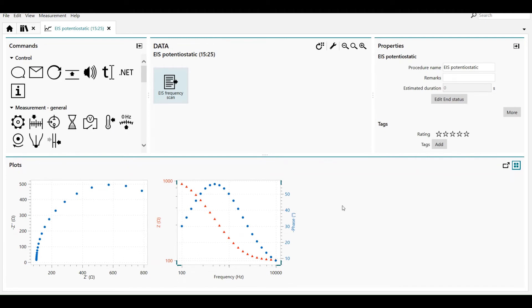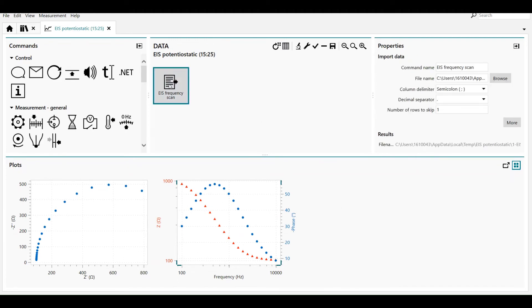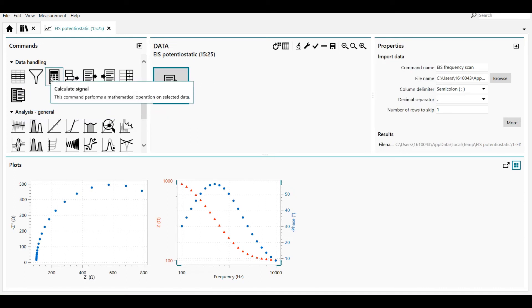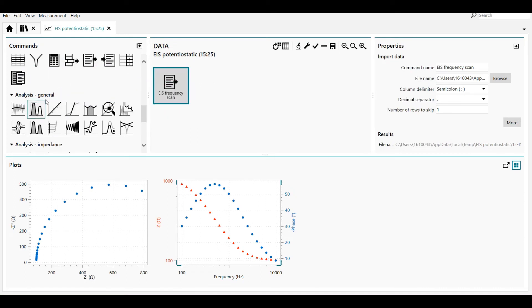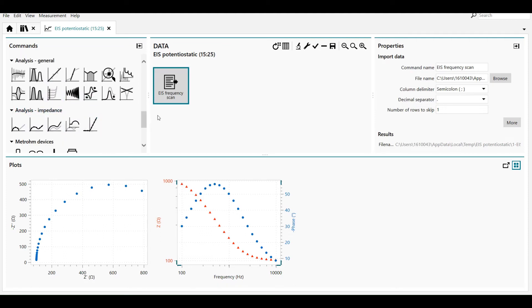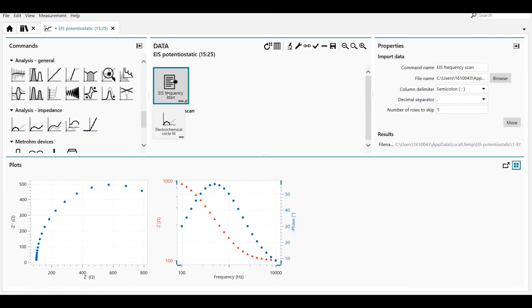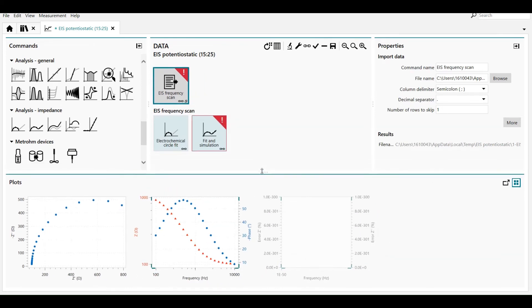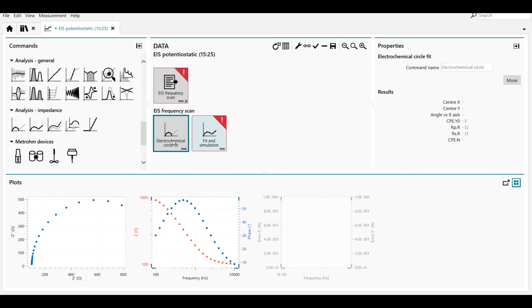Once you've opened the data in Nova you can do all kinds of analysis as well as data handling. You can use the windower, the build signal command, or the calculate signal command. There are also general analysis commands like peak search and smoothing. In this case we're going to use the impedance analysis commands like electrochemical circle fit — you can drag and drop this into the command — and also the fit and simulation command in the same way.